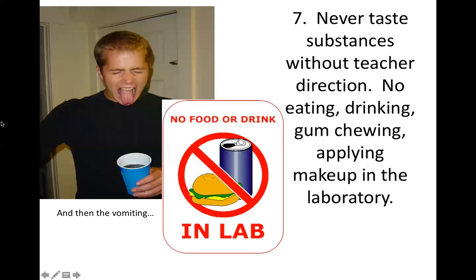Next, so it says here, never taste substances without teacher direction. No eating, drinking, gum chewing, applying makeup in the laboratory. So let's start with the first one, which is tasting substances. Tasting substances is allowed, but not everything can be tasted. Some chemicals can be tasted, but not all.